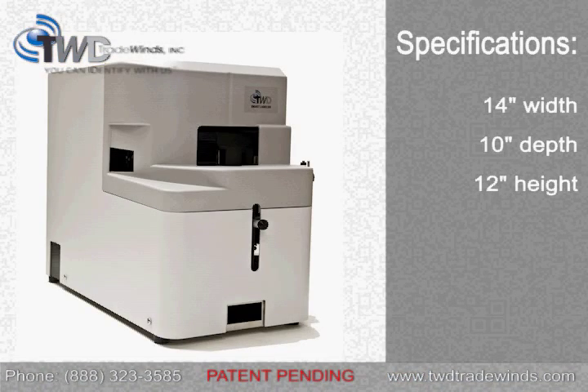The Smart Labeler is a perfect size for desktop printing applications. It has a small form factor of 14 inches wide, 10 inches deep, and 12 inches tall.